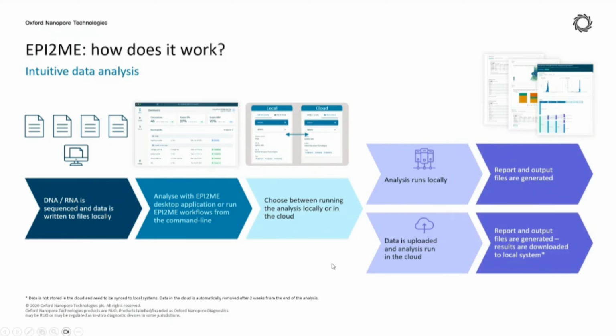The cloud is provided by ONT free for all ONT users. The process is all simply covered within the EPI2ME software. So you do not need to install any additional programs, or know how to upload data to clouds or how to set up an instance in the cloud, etc. Everything runs directly inside the EPI2ME software as long as you have it installed in your computer.